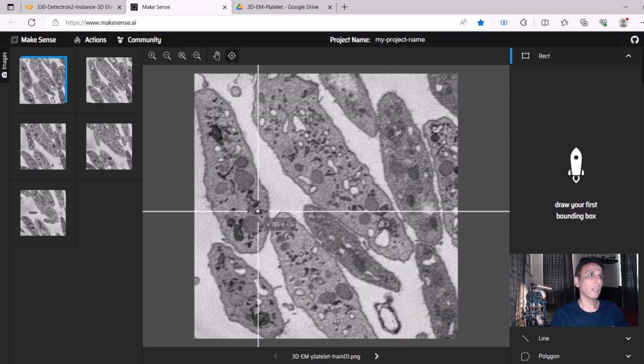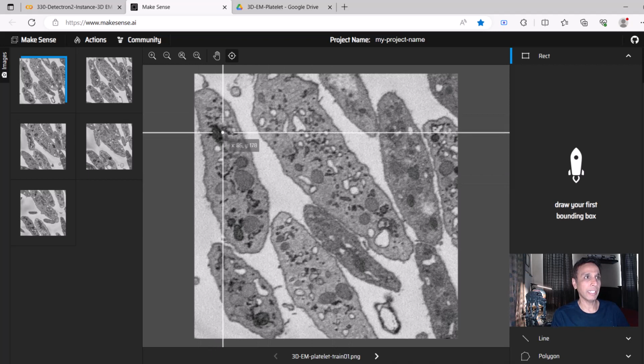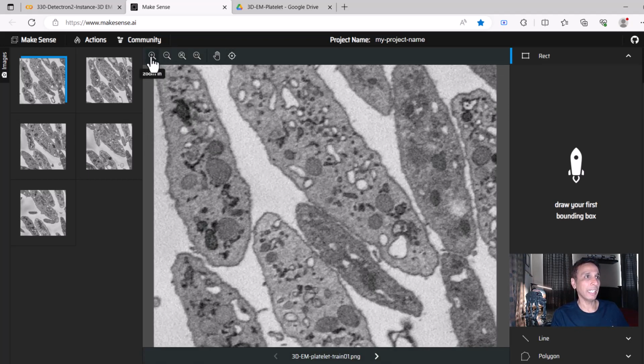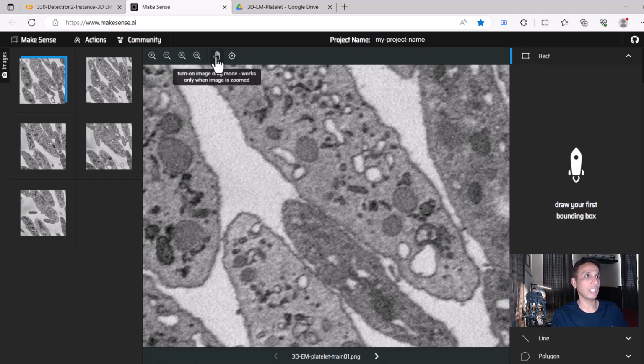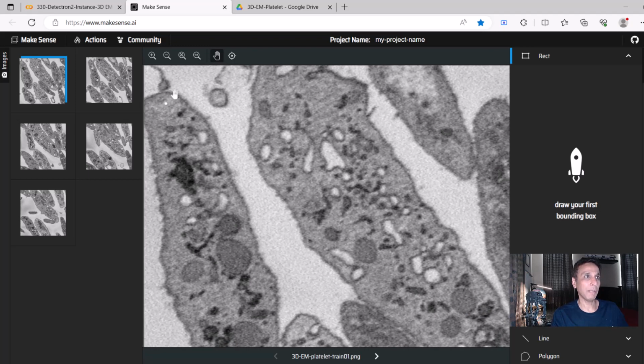Okay, now we are all set to go ahead and annotate them, and you can pick which ones to annotate. Let's say we are annotating the mitochondria. This is where I looked at the ground truth that these guys actually provided, and then looking at that, I'm annotating these. And I found these crosshairs to be irritating, so I turned the crosshairs off right there, and now you only have this. And now you can go ahead and zoom in and use the click and drag thing. This is how I start. Top left, I go down, and then I go down, and so on.